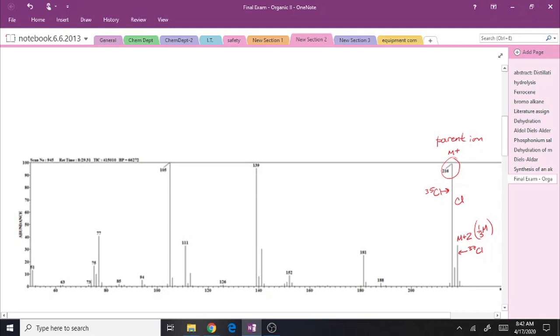And since in the mass spectrum we're looking at individual molecules or fragments as they come through, individual ions, they will have specific masses to that particular isotope. But we can then look at other peaks as well. This one, we have our M, but there is no M plus 2. So this one does not have chlorine.